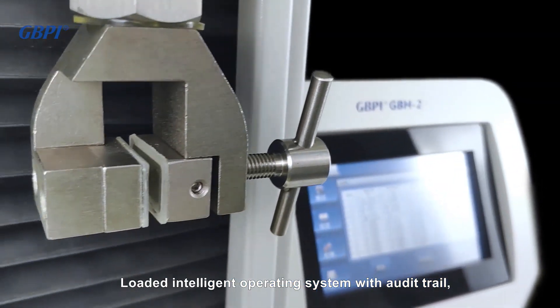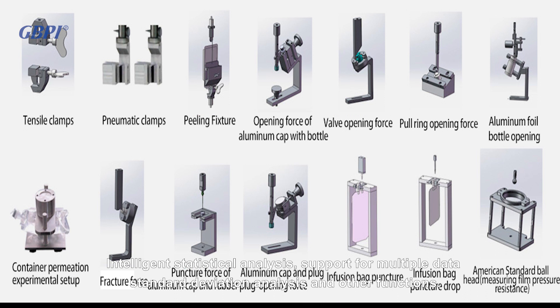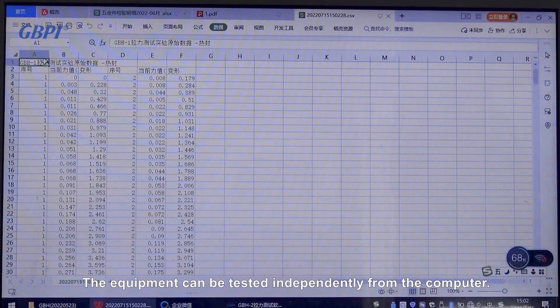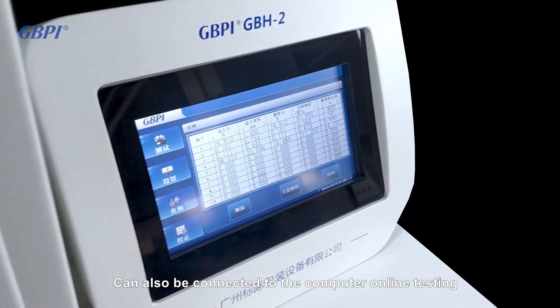The GBH2 is loaded with an intelligent operating system featuring audit trail, intelligent statistical analysis, and support for multiple data standard deviation analysis. The equipment can be tested independently from the computer, or connected to a computer for online testing.